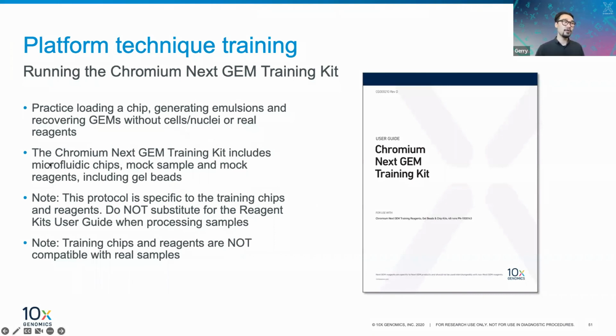This training chip includes, well, sorry, not mock microfluidic chips. They're real microfluidic chips, but you will be loading mock samples and mock reagents onto them, including gel beads. So you will still generate an emulsion that you can then break and recover, and we will go through all of that while the people providing the samples are prepping their samples.